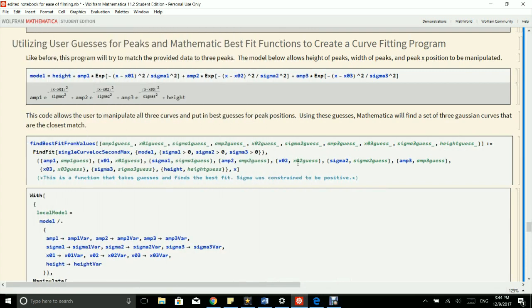So after I have data, I'm able to write code that allows the user to input guesses for where they think the peaks should be located. And then Mathematica uses a function called find fit. That's going to find the best approximation for my data given the guesses and the model I give it to work with.